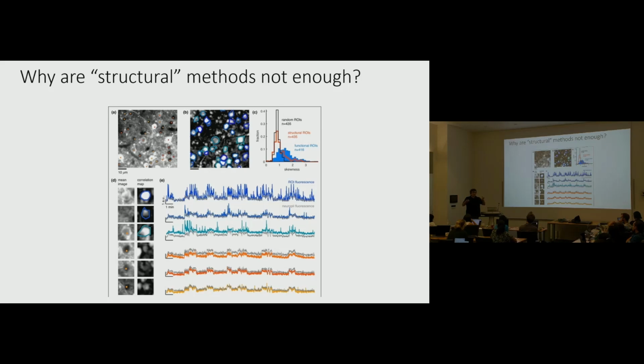They're pretty similar because they mostly represent really high densities of neuropil, literally millions of axons that are going around in all sorts of places. And because they're averaging so many elements, the background tends to represent the average activity of this entire area. So it is maybe the same over a portion of 50, 100 microns, and then it slowly gets less correlated as you go further away. But roughly within the area where we record from, it should be pretty constant around our cell.